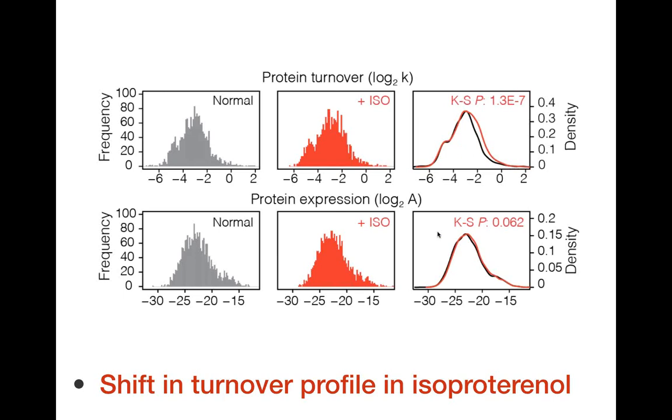We actually did do the fractionation. We have 3 fractions. One of them is all the soluble cytosolic proteins. Okay. And that fraction is the mitochondrial and probably ER proteins. Okay. And lastly, we have debris fractions that contain a little of everything, but is enriched for nuclear and extracellular proteins that are not very soluble. That's why I'm asking, because the sarcomeric proteins would be in that first low-speed spin, and that's what I'm interested in.